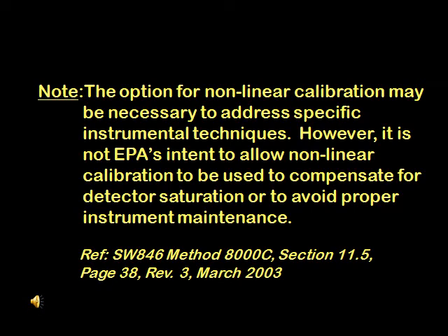Method 8000C in the Arizona regulations, however, contains the EPA statement of intent to not allow nonlinear curves to be used to compensate for detector saturation. Arizona believes that this statement does not preclude the use of quadratic curves for situations similar to that of the chloromethane curve that was just presented, where very small amounts of detector saturation are present.